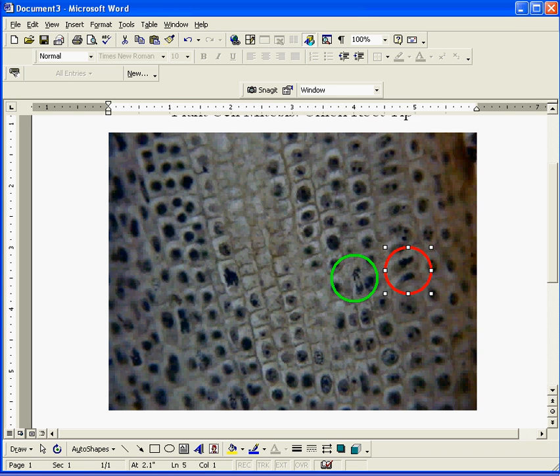Alright, so you notice I've got 2 guys already identified here. There's the green one, and if you take a look at it, it kind of looks like spiders fighting. Alright, I told you what phase that would be. And in the red circle, you may notice that there's 2 things that almost look like 2 prophases side by side, but in between there's this little line forming.